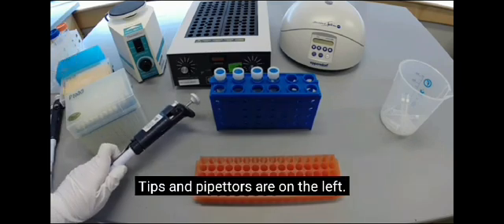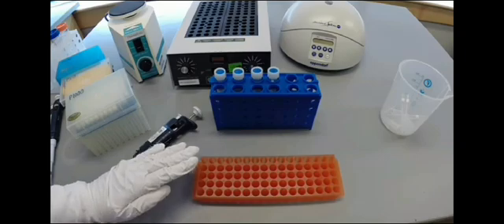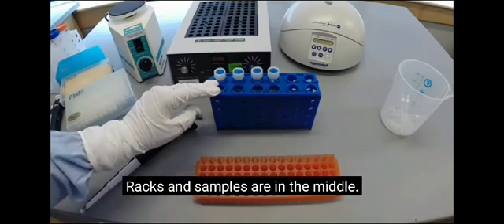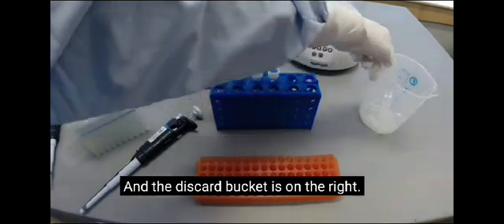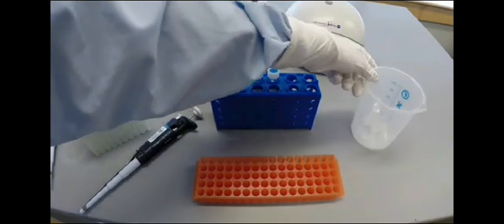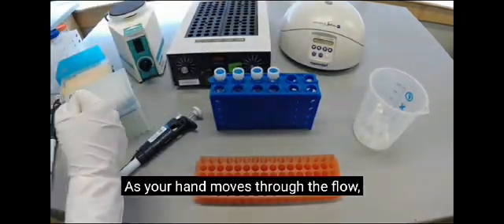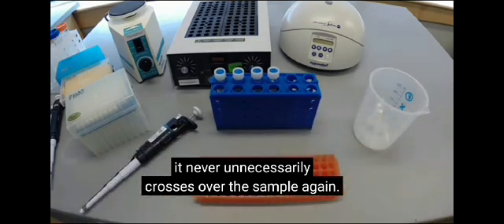Tips and pipetters are on the left. Racks and samples are in the middle, and the discard bucket is on the right. As your hand moves through the flow, it never unnecessarily crosses over the sample again.